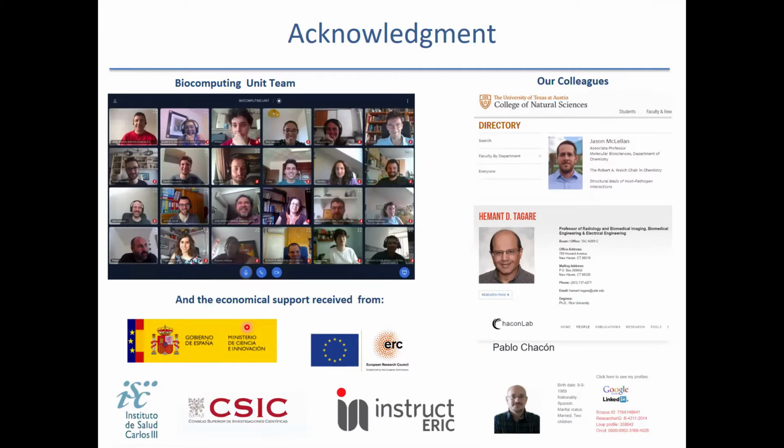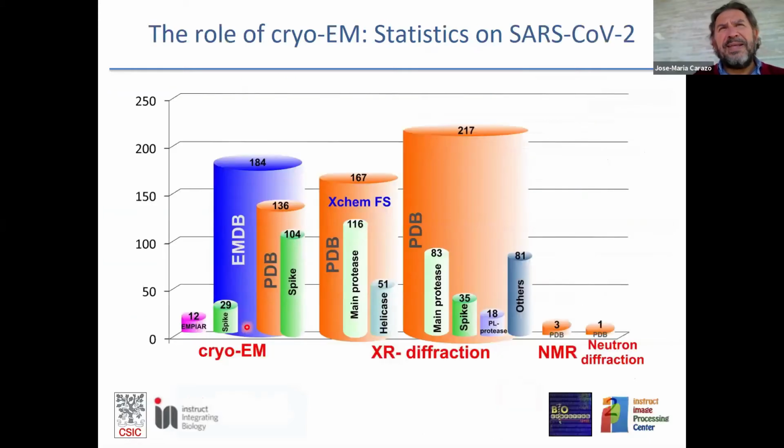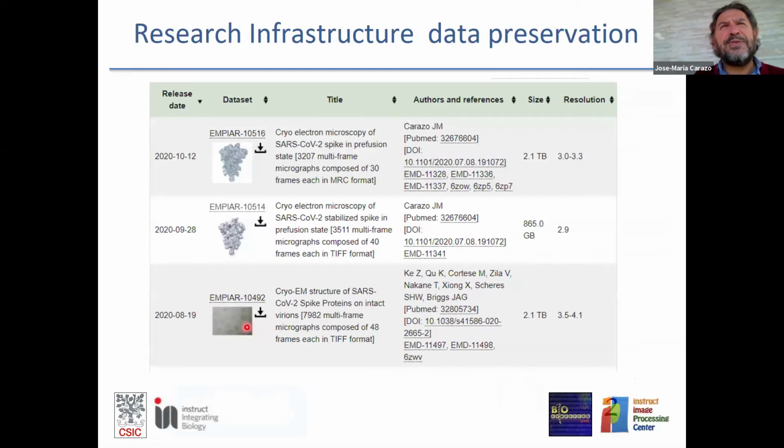There is a question on what is the difference between both sharpening methods and when it is suggested to use each one of them. Okay, very interesting. I will answer, and Marta can also say things.